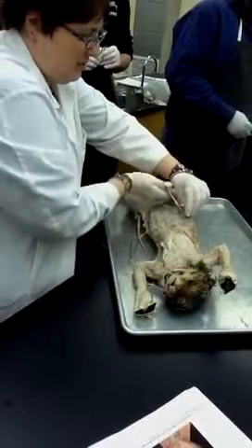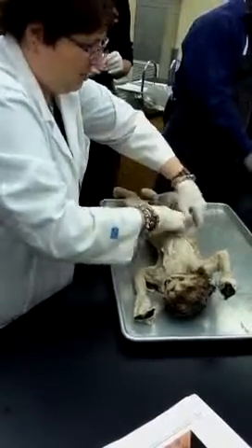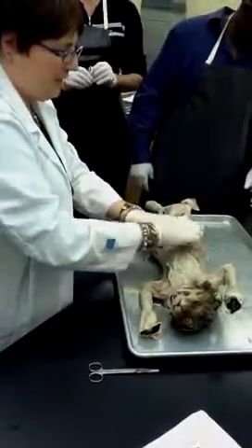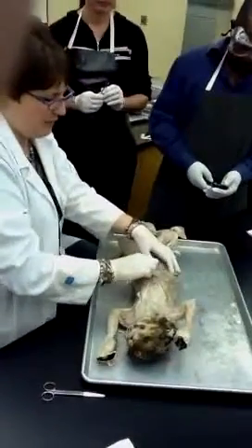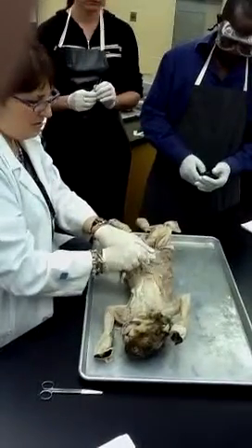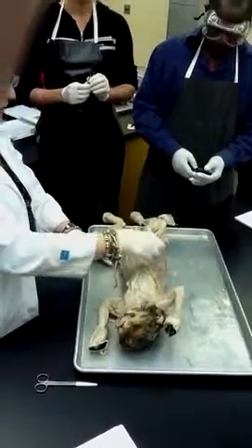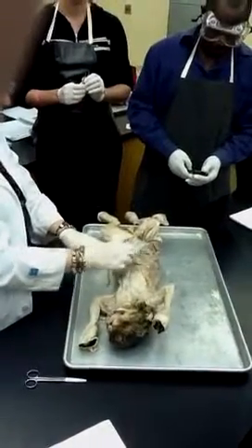I will just help you transect this a little bit better. When we transect the external oblique, underneath is the internal oblique. And then I didn't realize this wasn't dissected enough. If you make a window through your internal oblique, you will see the transverse abdominis. I would have to really pick at that to see it, but that would be down there. So again: rectus abdominis, external oblique, internal oblique, and transverse abdominis.